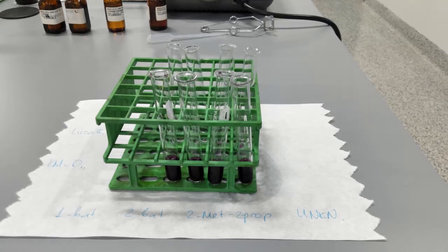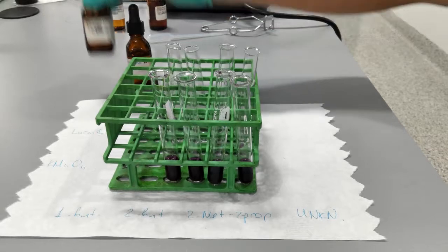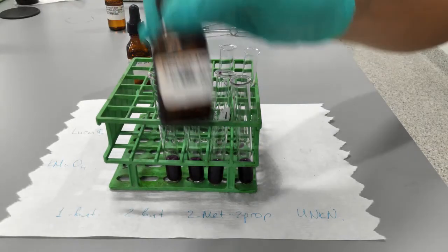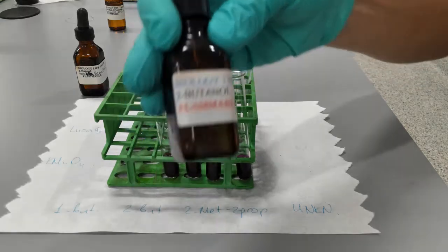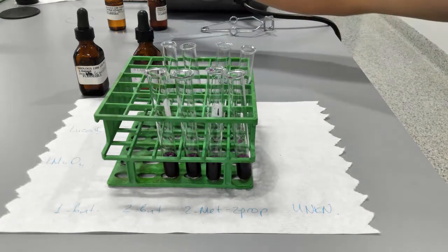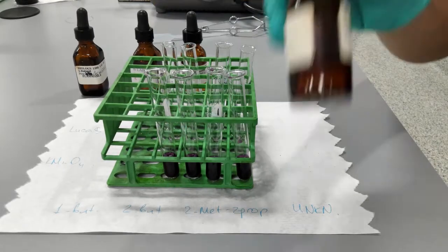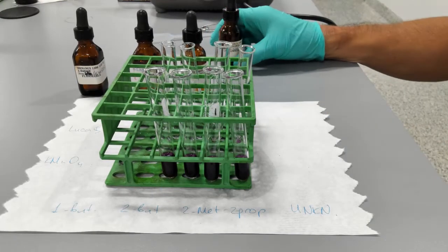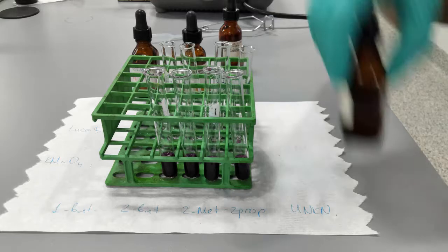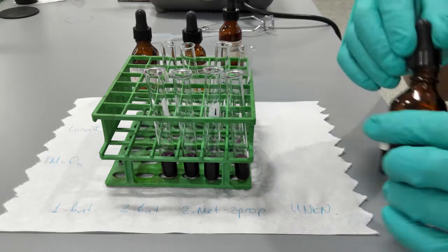Now, in the first part of the experiment, I'm going to be adding different alcohols, 1-butanol, 2-butanol, 2-methyl-2-propanol, and the unknown alcohol to 4 tubes that contain potassium permanganate. Each tube contains 2 milliliters of potassium permanganate.